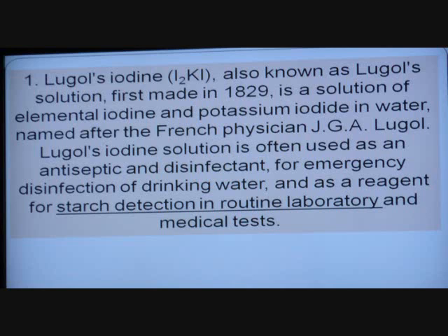And that Gram stain, you may have seen bacteria that are Gram positive, Gram negative. Well, they use that to stain bacteria because of the starch the bacteria contains inside it. Well, if that finds starch in bacteria, it should find starch in my bread. That was the premise. We'll find out.